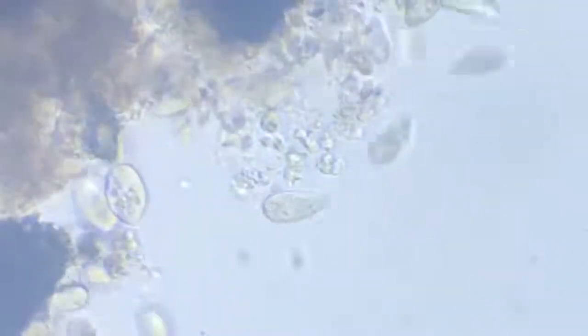For a better view, we go to a higher magnification. That is the 40x objective. Just give me a second while I focus it. All right, here it is.